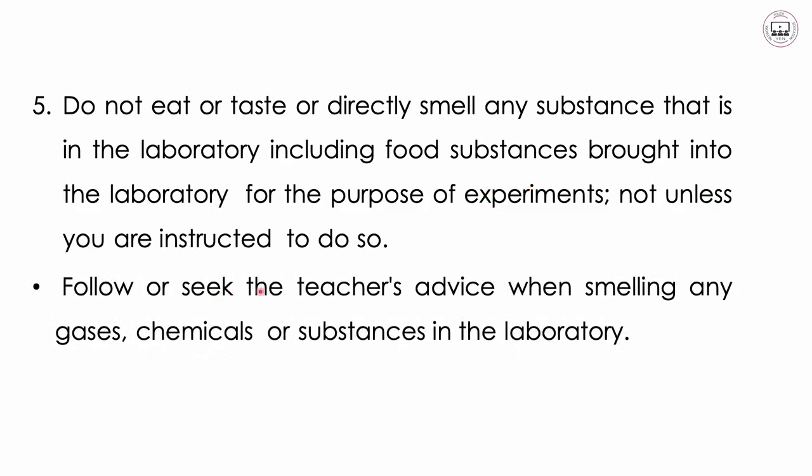So follow or seek the teacher's advice when smelling any gases, chemicals, or substances in the laboratory, because some gases, chemicals, or substances are hazardous to our health. You may smell such gases or chemicals, and they might cause problems to your health.